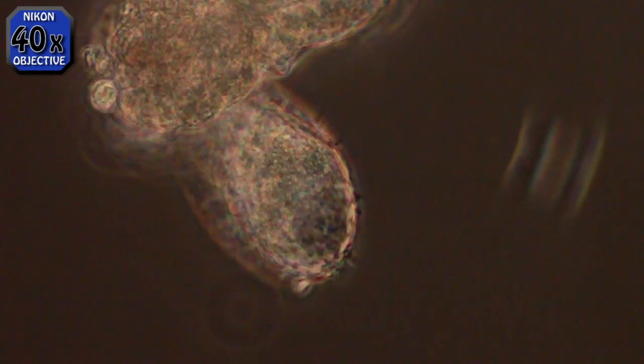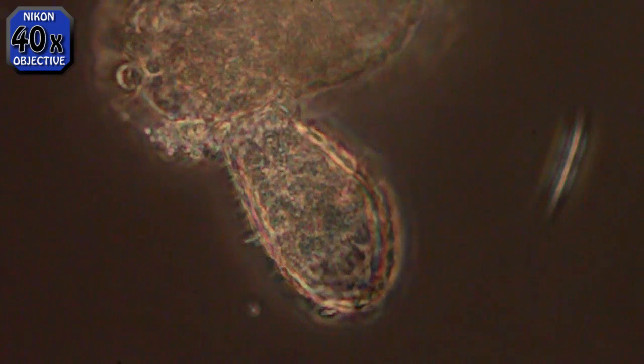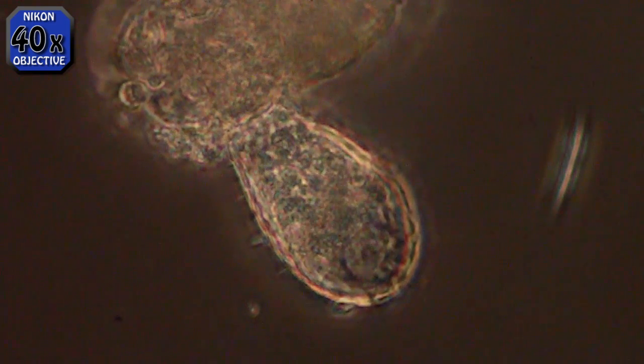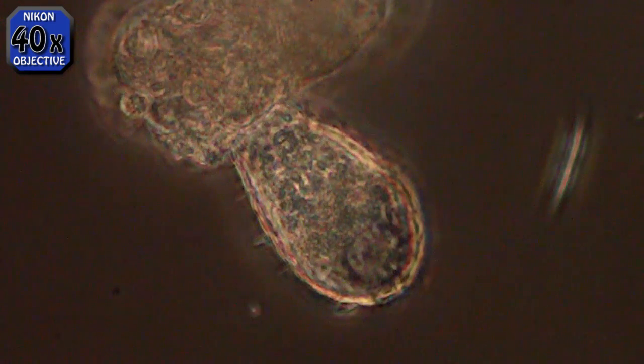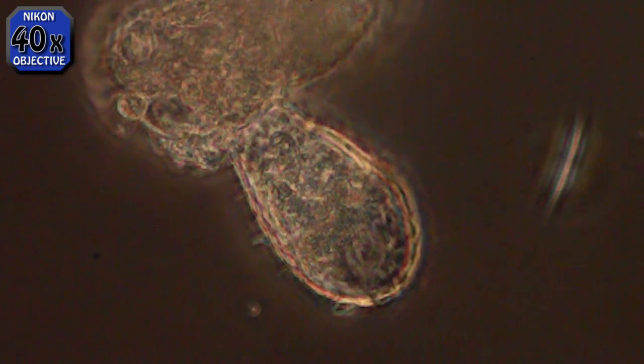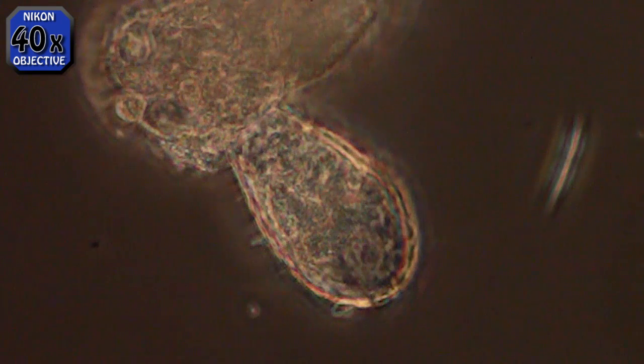I've never seen one with these little projections on the shell — the outer part of the shell. It's the first one of those I've seen. And at the mouth end you can see the actual shell has a sawtooth edge on it. He doesn't use it for sawing.